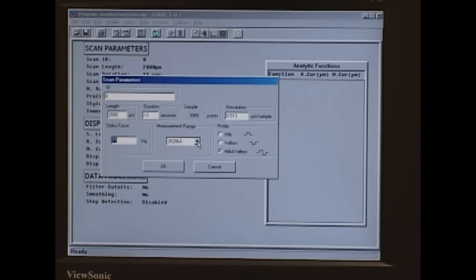The measurement range is basically if we have any idea of what height to expect from our features. So we know this one is fairly small. We'll choose 65 kilo angstroms. The profile is also what you're expecting. If you don't really know what to expect, you can choose hills and valleys. Or if you know you're measuring the depth of a scratch, for example, you can use valleys. Or if you know that you're trying to measure the height of a step height, you can choose hills. And that's what we're doing.